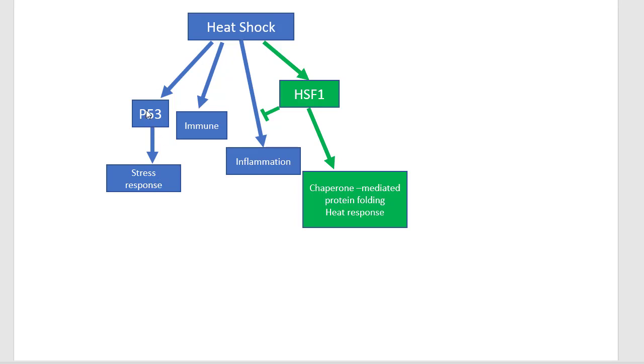On the left side, P53 seems to play a role in mediating the stress response independent of HSF1, and have immune response, immune cell migration, also have an inflammation response. Heat shock also induces inflammation response, and that response is somehow reduced if we have a functional HSF1.